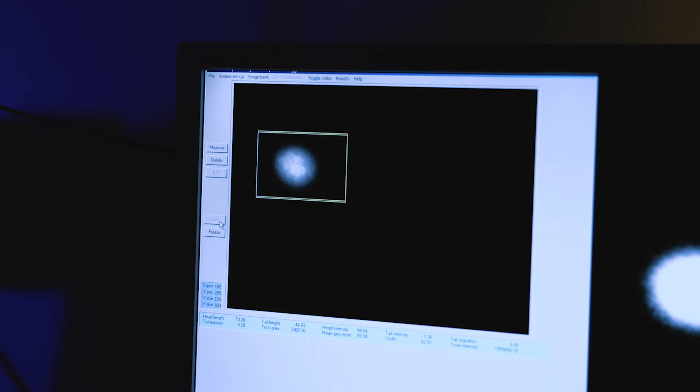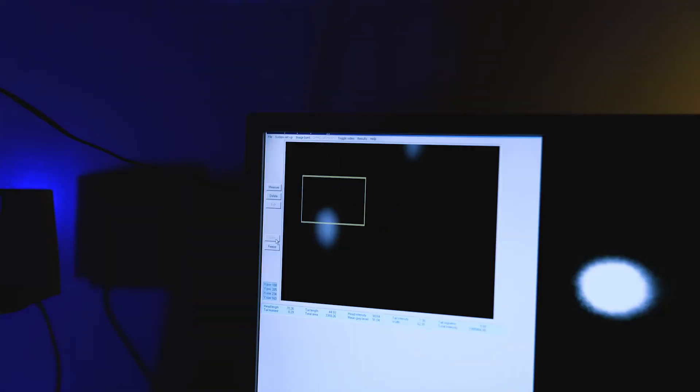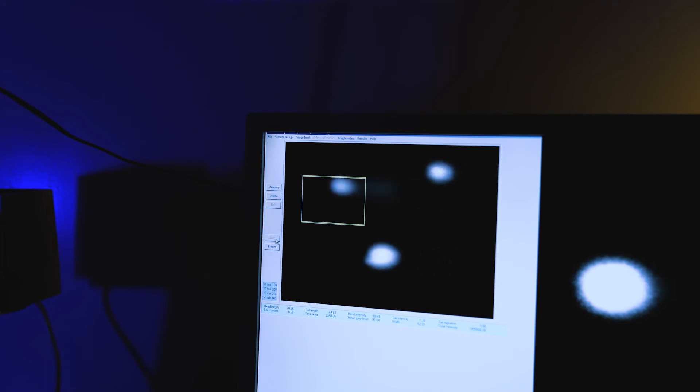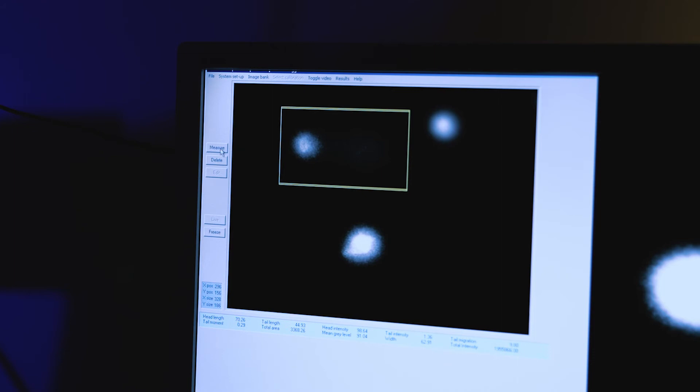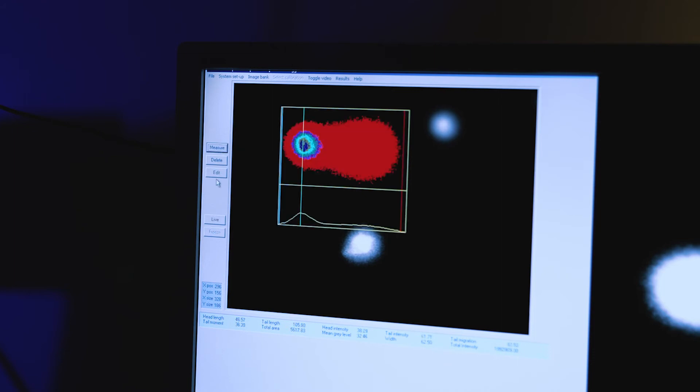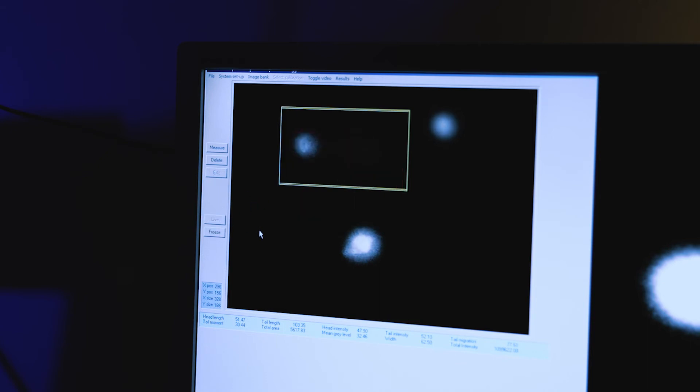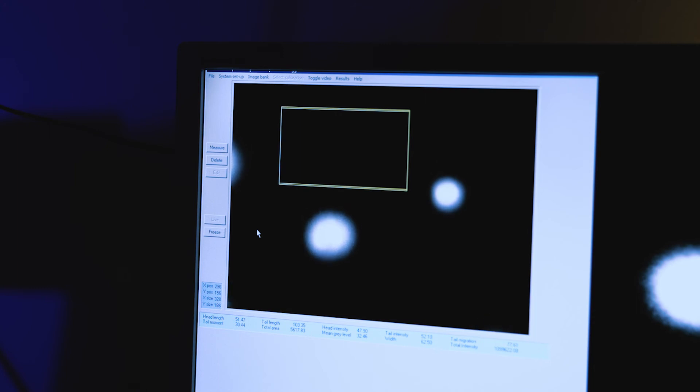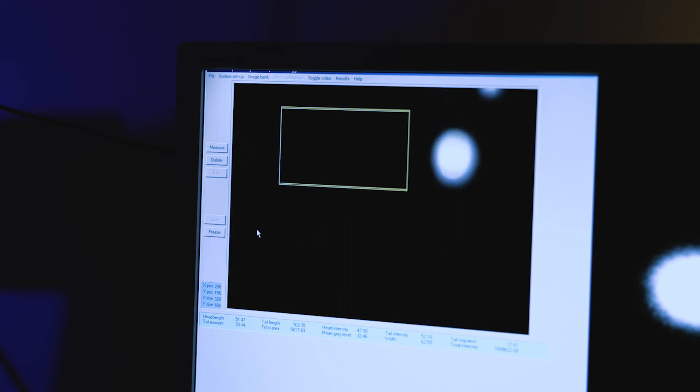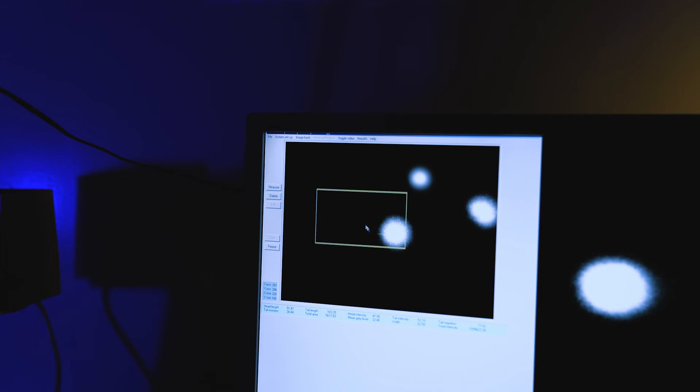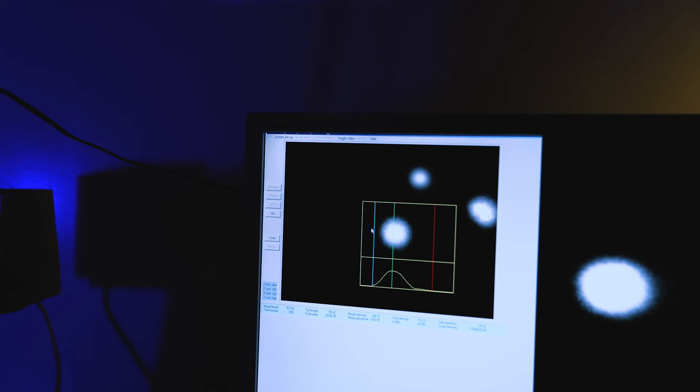And then you can continue doing this by finding comets. There are also comets with long tails. You continue doing this until you have scored 50 comets per sample. So if you do duplicates you will have a hundred comets for each condition in total.